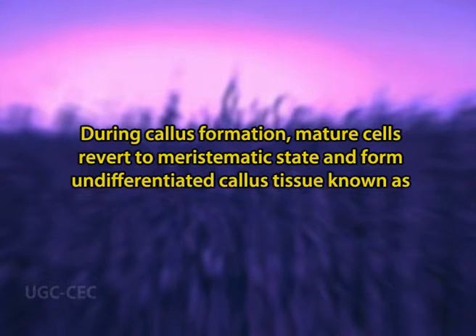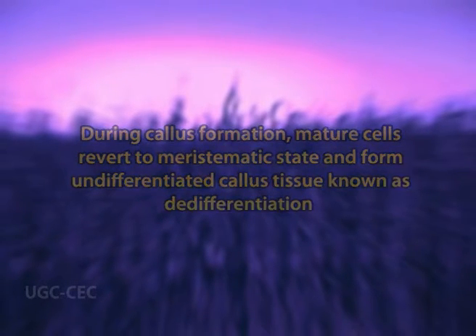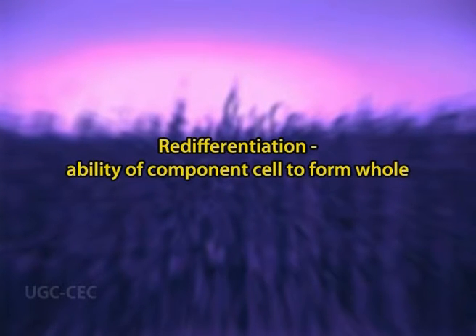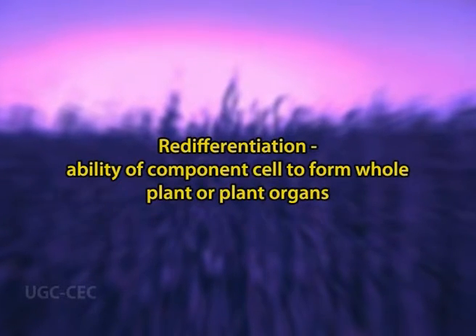During callus formation, mature cells revert to a meristematic state and form undifferentiated callus tissue. This phenomenon is known as dedifferentiation. The ability of such cells to form a whole plant or plant organ is known as redifferentiation.